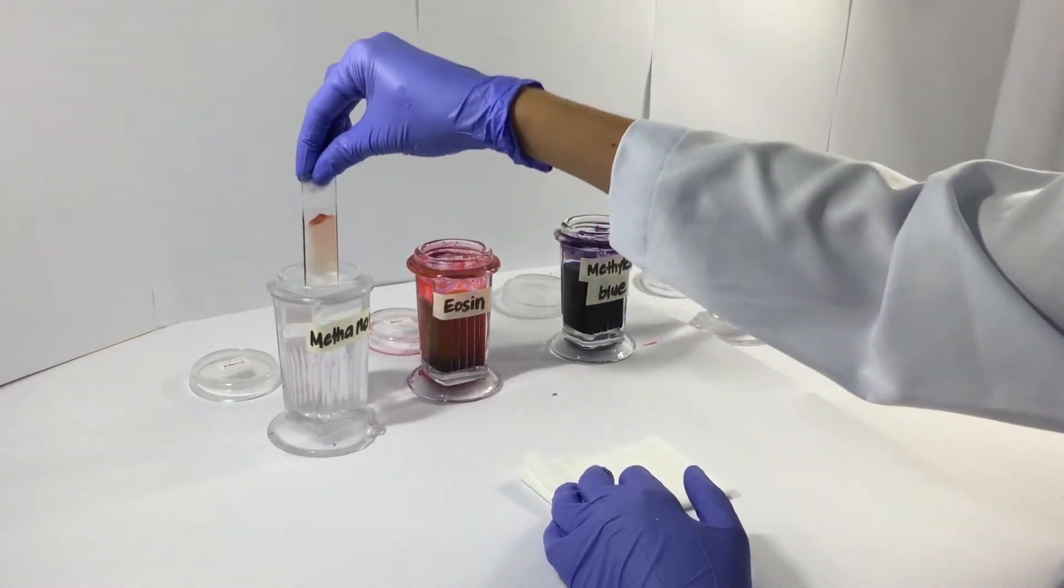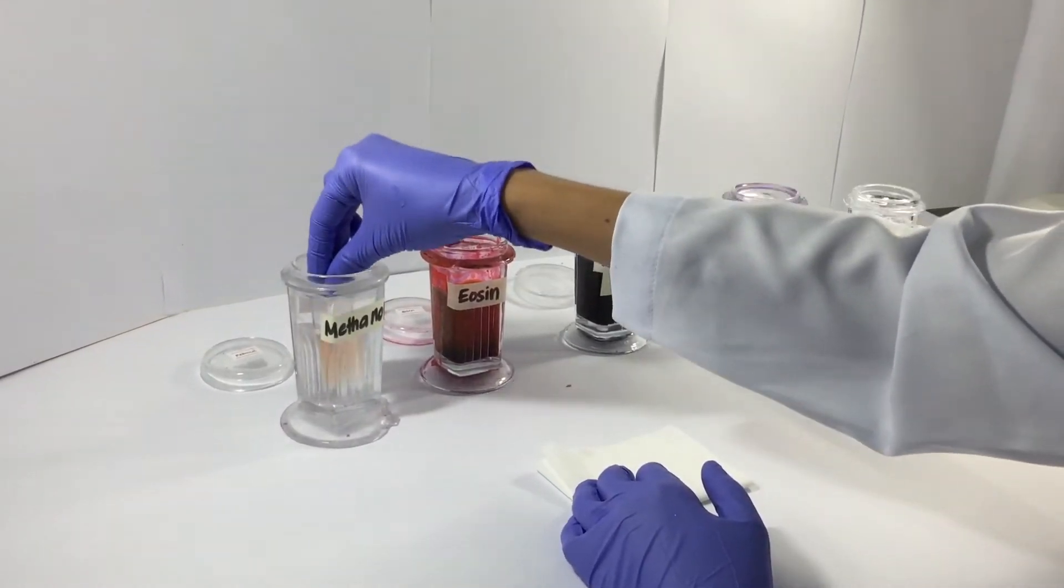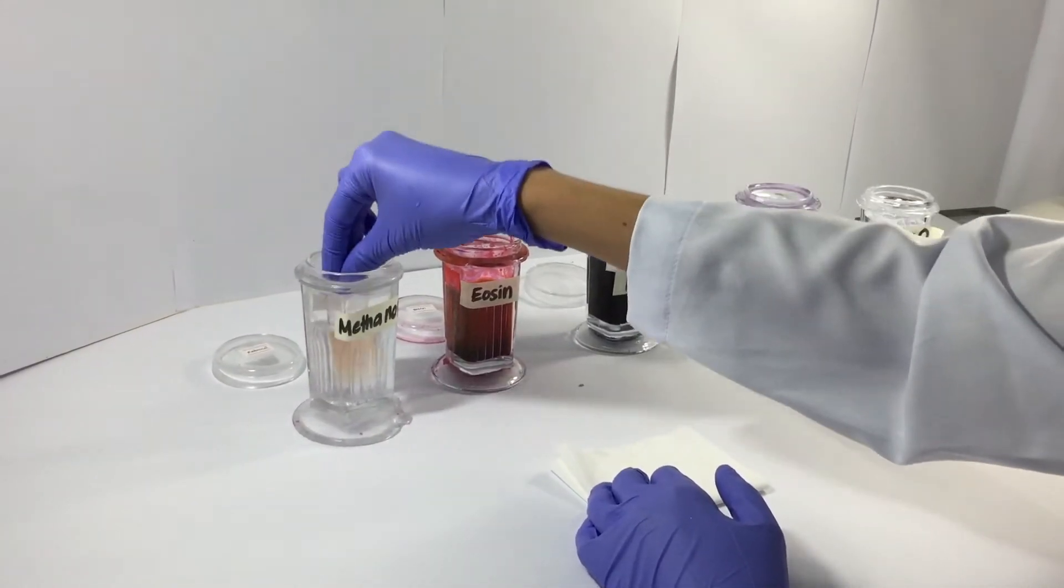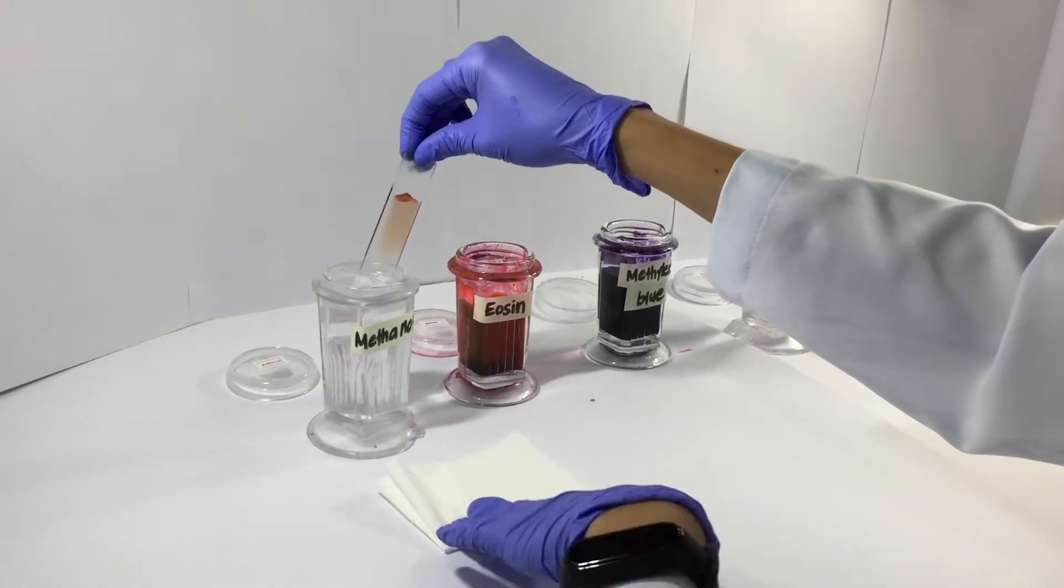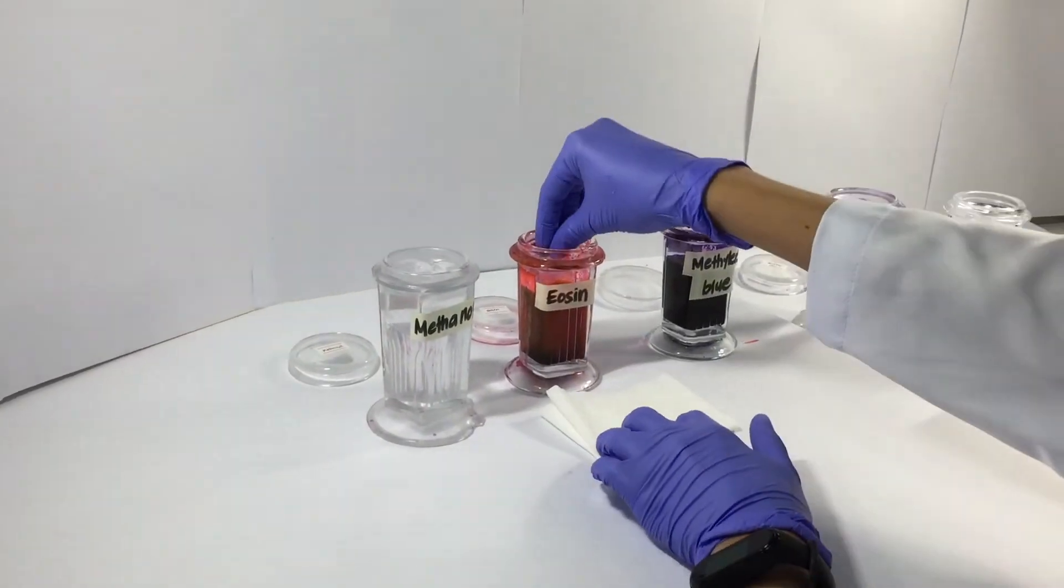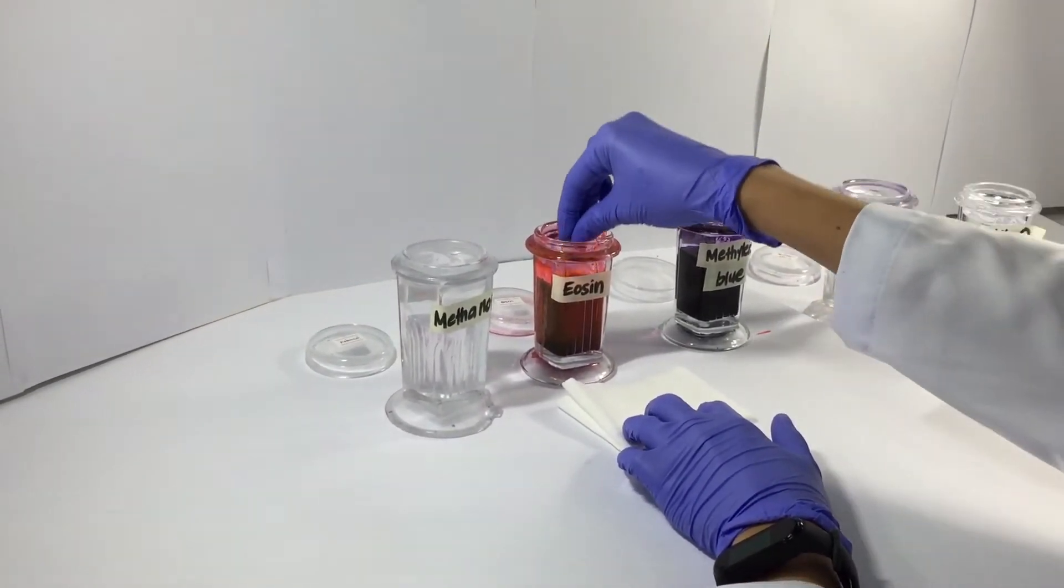Make sure your smear is completely dry before you start the staining process. When you begin, you dip it first in methanol for 30 seconds. This forces the cells to be fixed onto the slide.